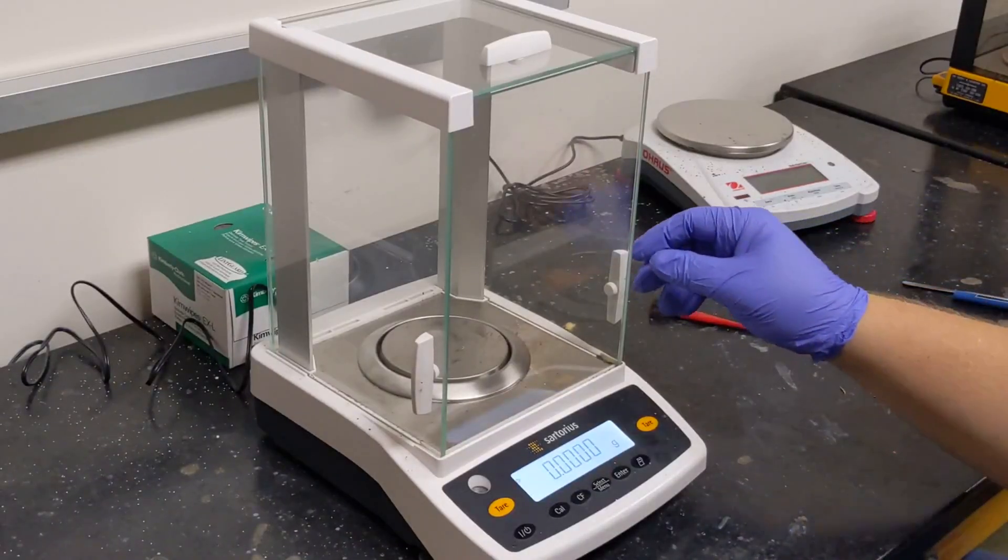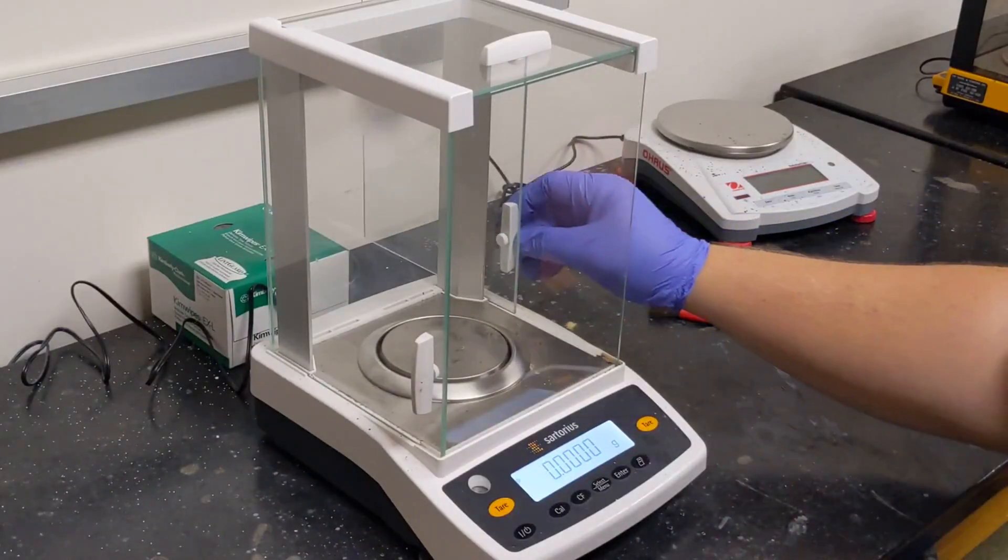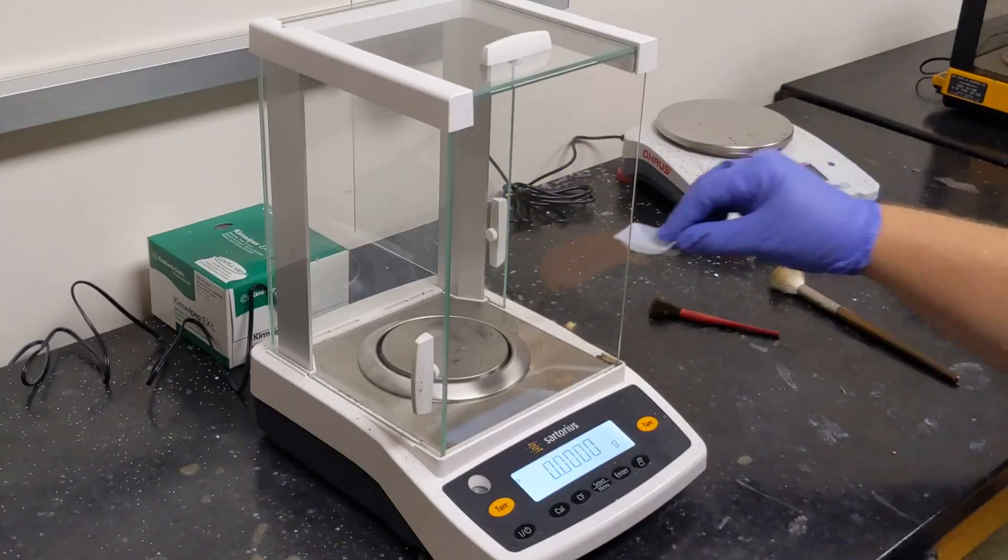We'll start by opening the door to the balance. It slides along a track, and then we will add a weighboat.